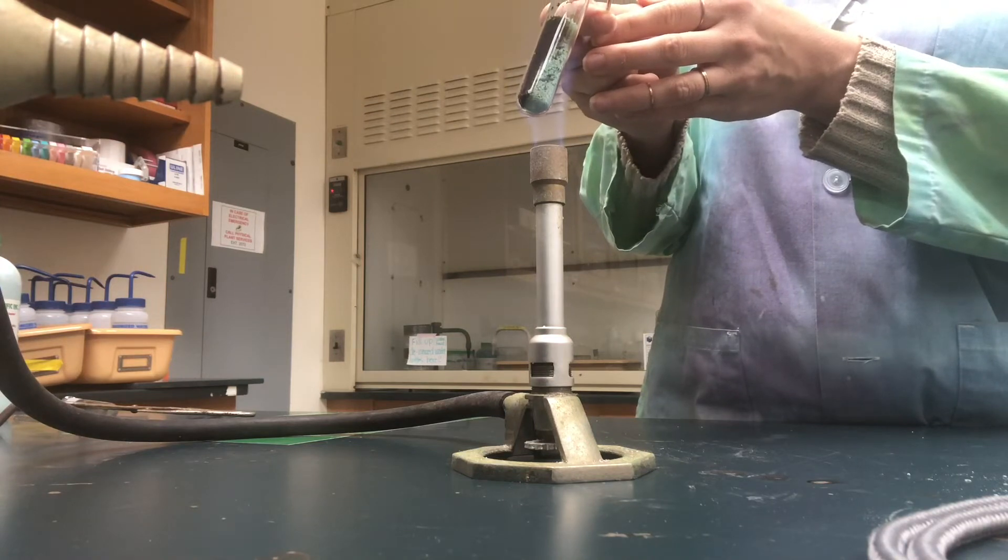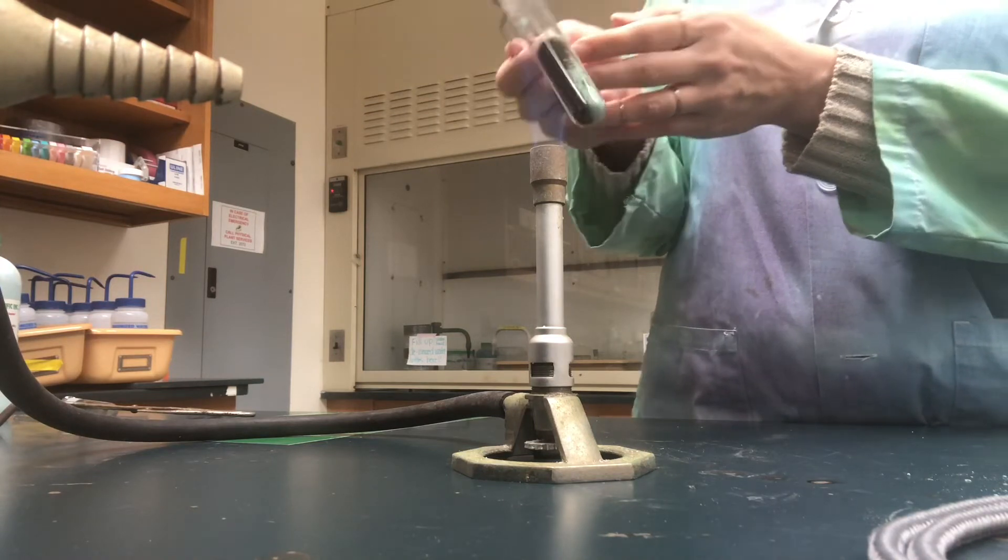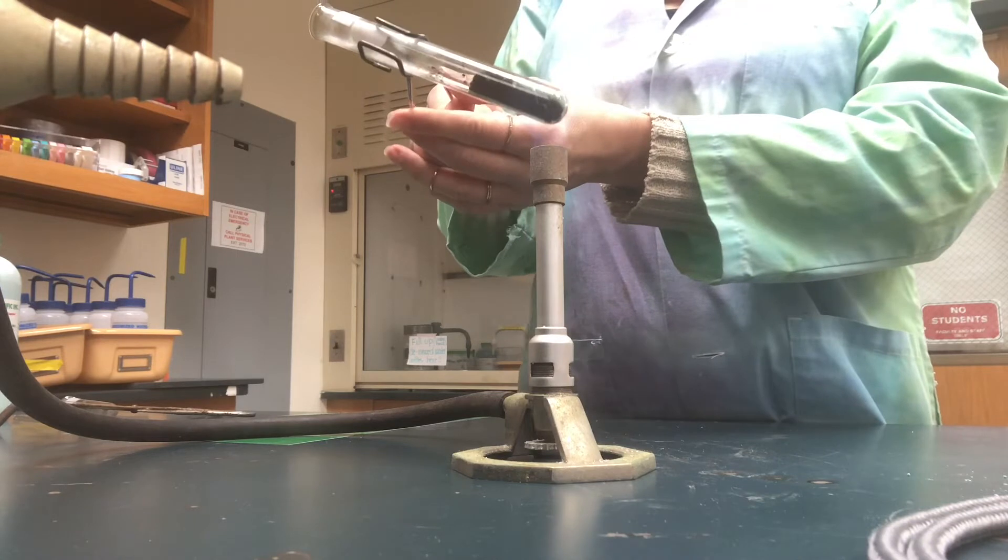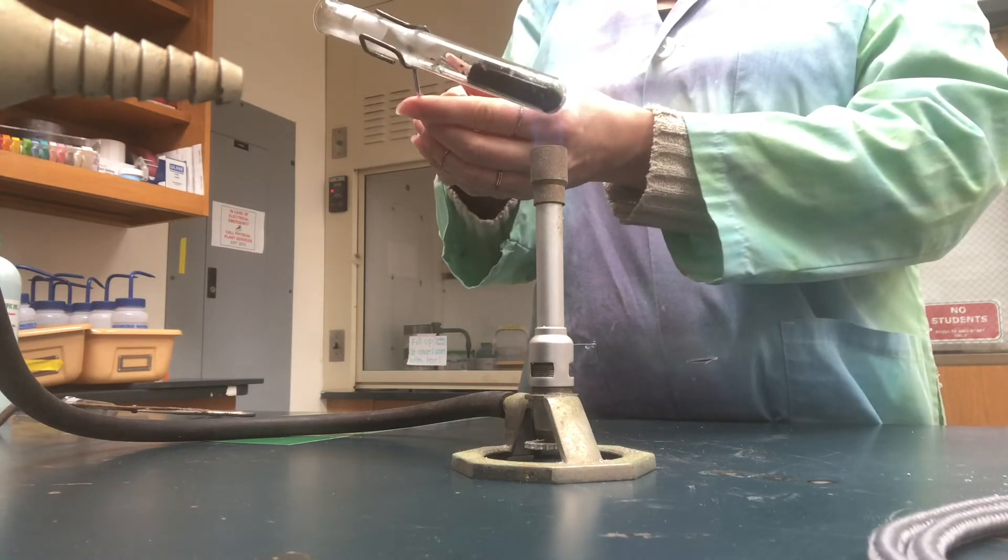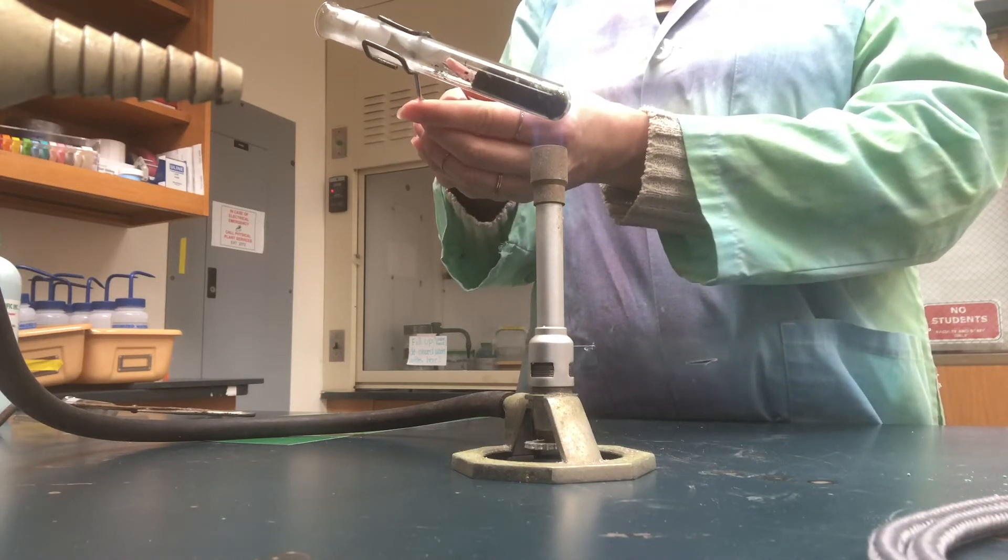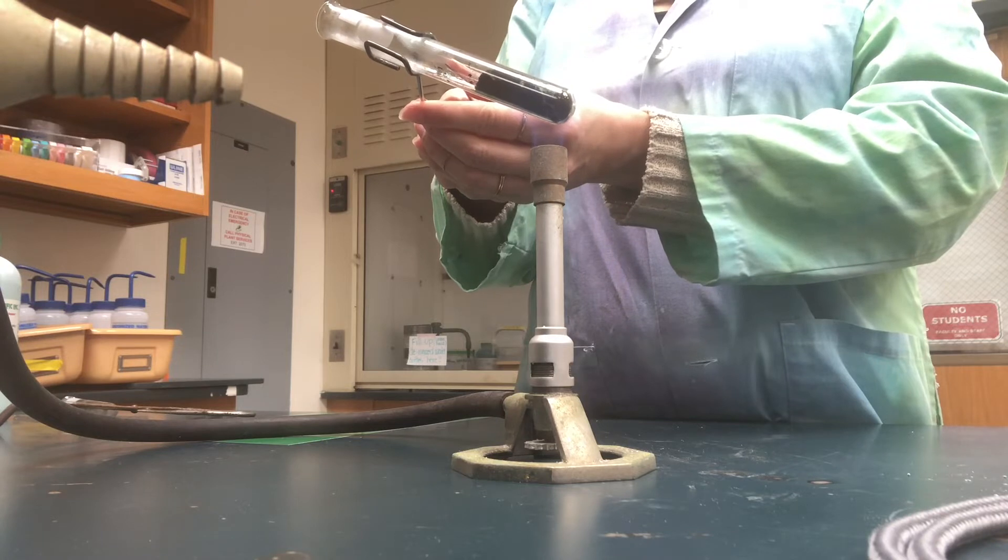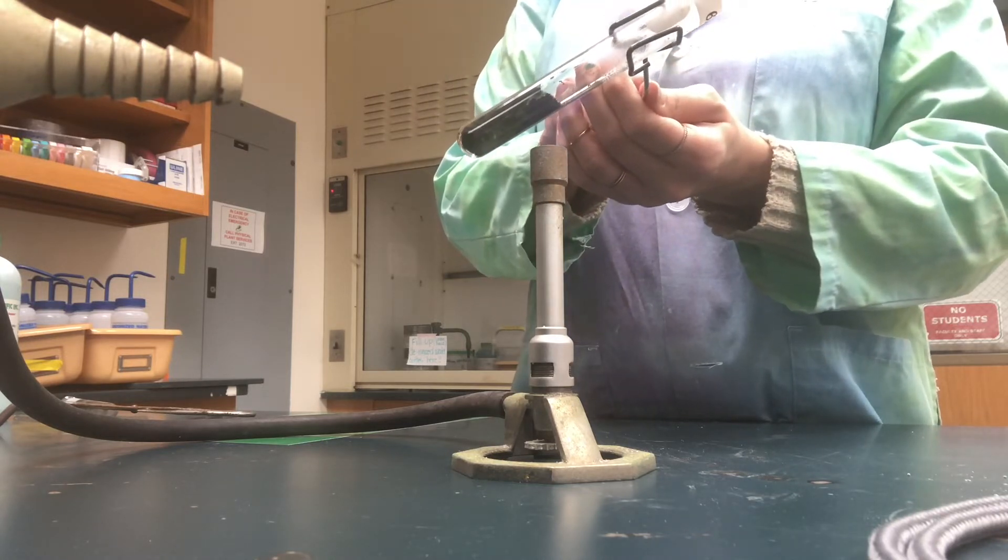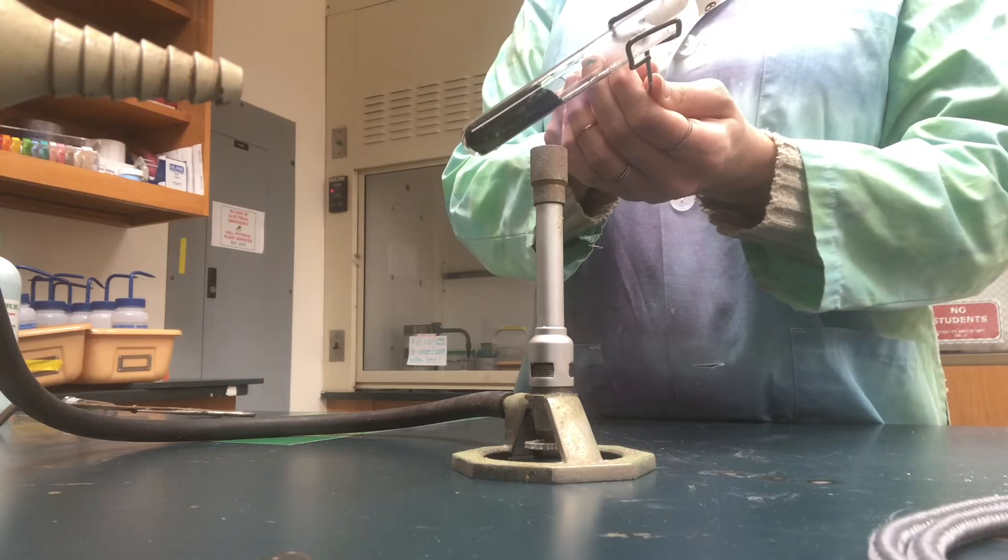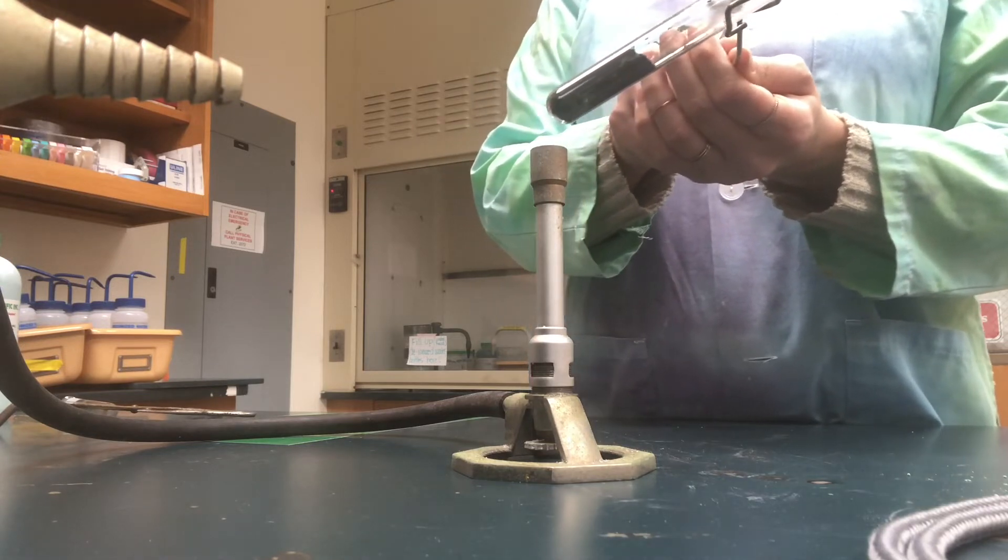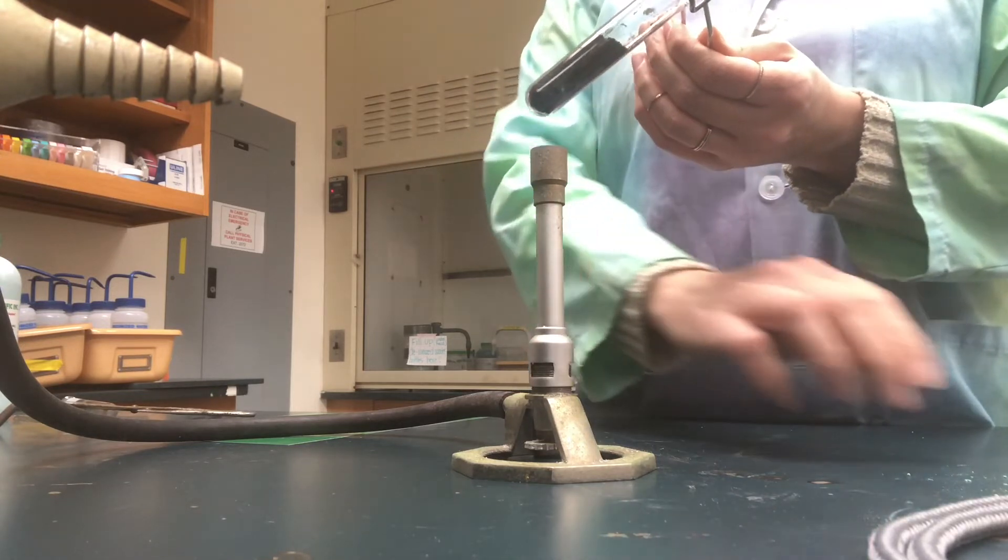In a minute here I'm going to do something called a wooden splint test. A wooden splint test is used to check for the identity of the gas that's being produced. One of our products here is a gas. Our compound is going through a chemical change. Atoms are rearranging and forming into new things and those new things have new identities.